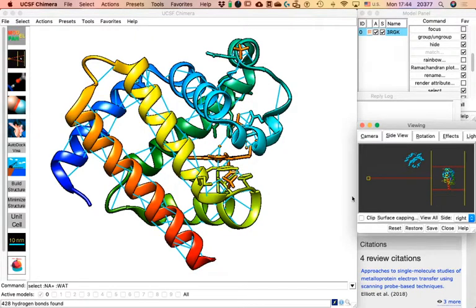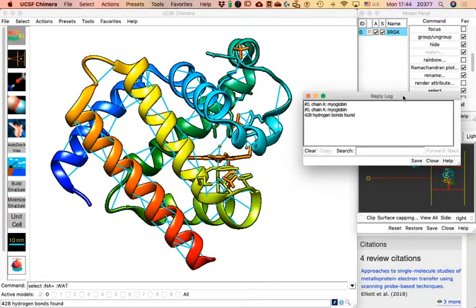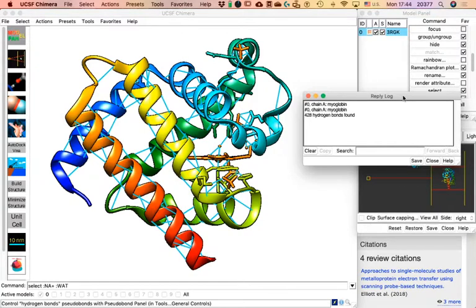Now in my Reply Log I got this number: 428 hydrogen bonds. They are also briefly shown on screen, but that update text changes very quickly — so if you didn't catch the number there, it's always in the Reply Log.